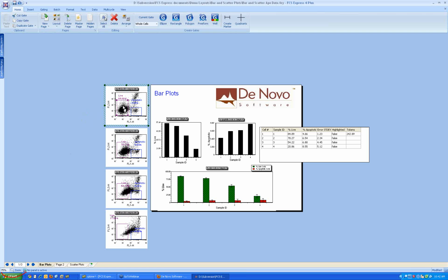And in fact, on bar charts, if you look on the bottom one, you can have overlays and have 2 bars next to each other. One of the things that I do want to point out, if you look in the chart over here, there are several things that are very interesting. One, the plot on the bottom, you notice the error bars. The error bar heights are actually also based on the data and are updating dynamically as you change your data to reflect the new error bars. And I want you to notice the colors of these 2 bars over here as I move my gates.